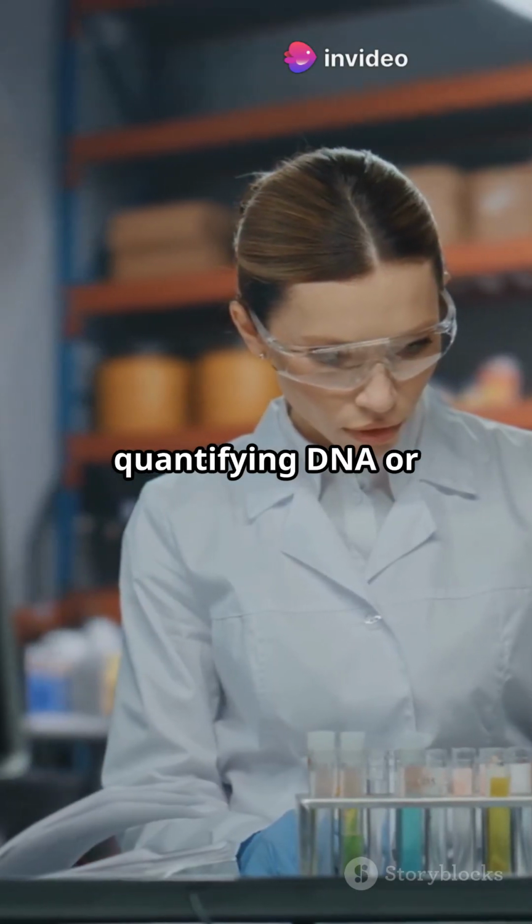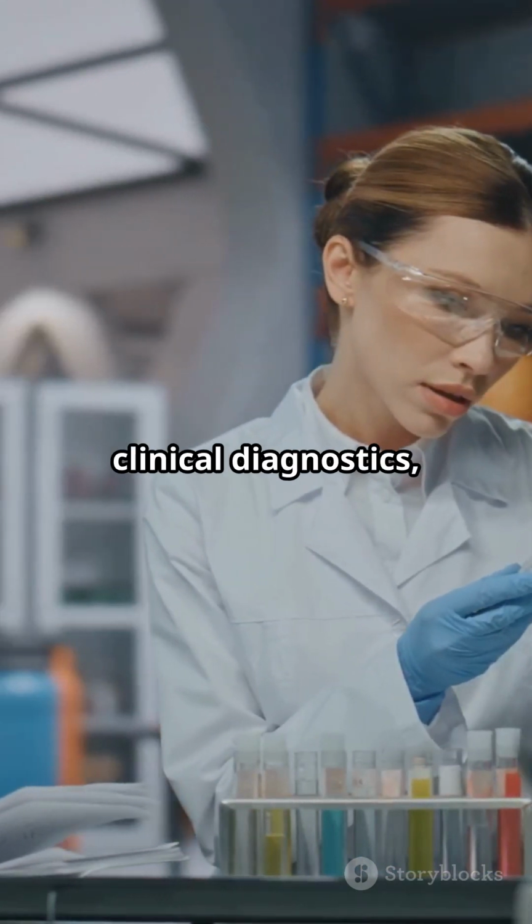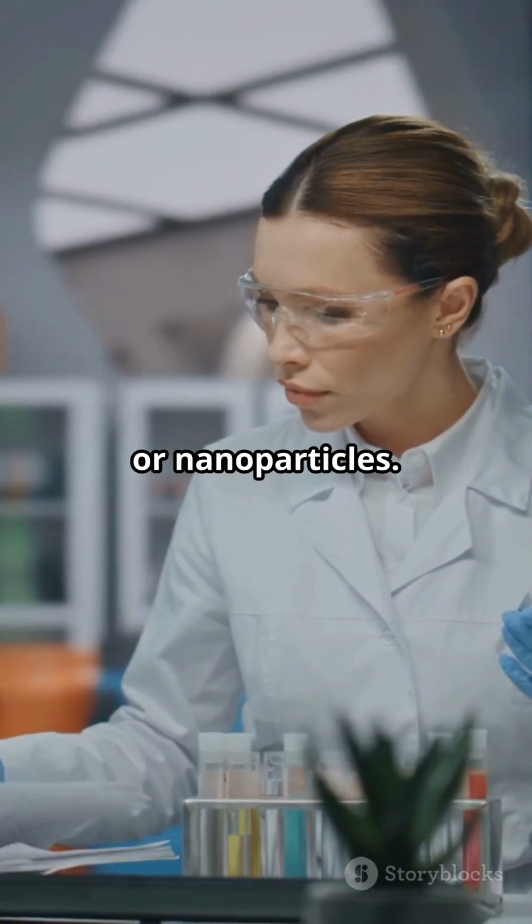Applications include quantifying DNA or protein concentrations, measuring solution concentrations in clinical diagnostics, and characterizing materials such as pigments, dyes, or nanoparticles.